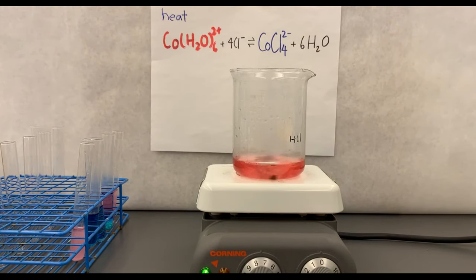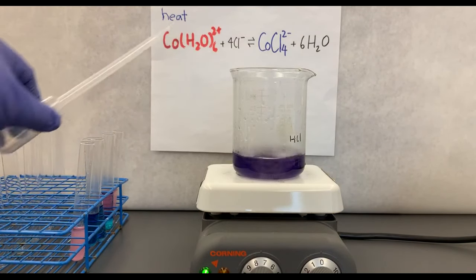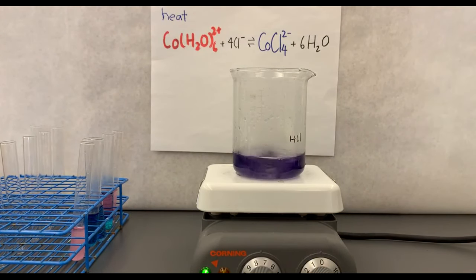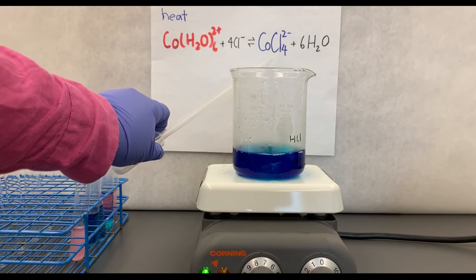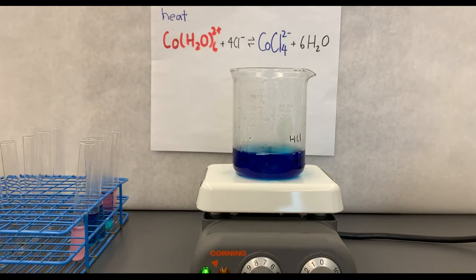And I will need to add quite a bit of HCl, so I have an extra large pipette to do exactly that. Okay, notice that the reaction has started to turn a purple color. Remember, when it is purple like this, what is in solution is really some cobalt water complex and some cobalt chloride complex. So when it's purple like this, you have some of this and some of this. Okay, I'm going to continue to add. And notice that the reaction has turned dark blue. Again, it is blue because I have added so much Cl- by adding HCl that I have formed the CoCl4 2- complex completely, 100%, in this beaker.